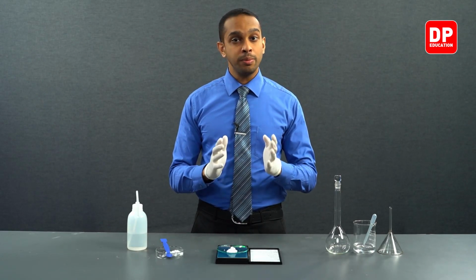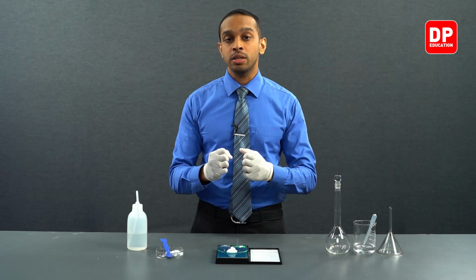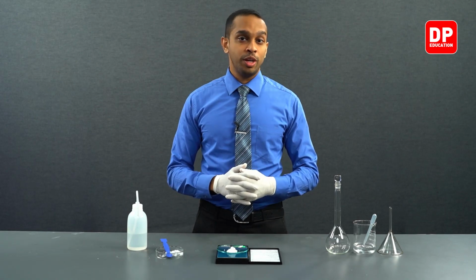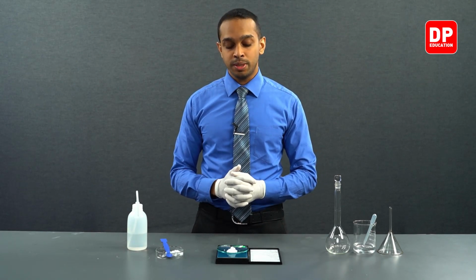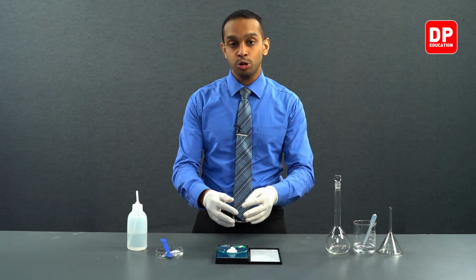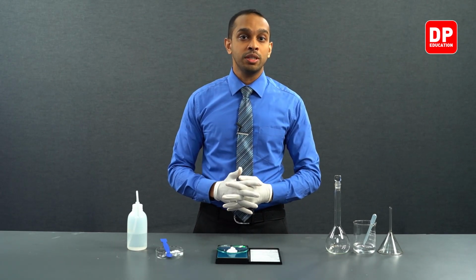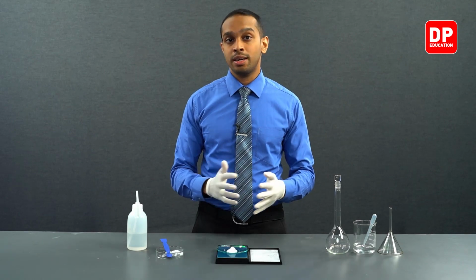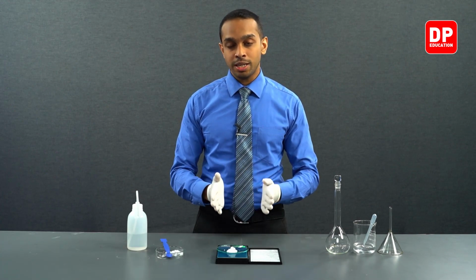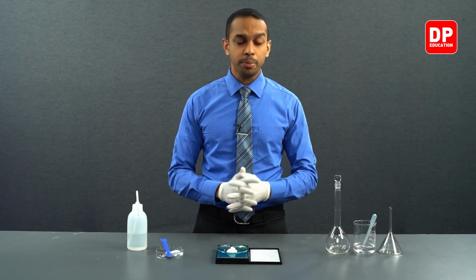That is, primary standards should not be hygroscopic, which means they should not absorb water from the surroundings or from the atmosphere. Normally, whenever you are weighing a hygroscopic substance, you can see that it absorbs moisture from the air and starts to dissolve on the watch glass itself. This is not a good feature for a primary standard, so anything that is hygroscopic is not a good choice for a primary standard. And potassium oxalate is not hygroscopic, so that is actually perfect for a primary standard.